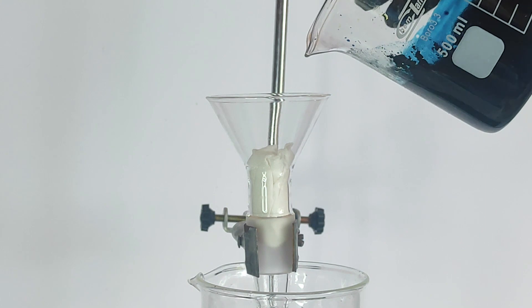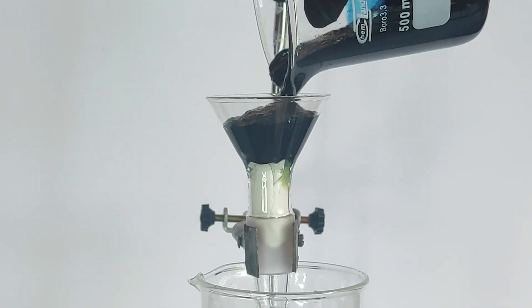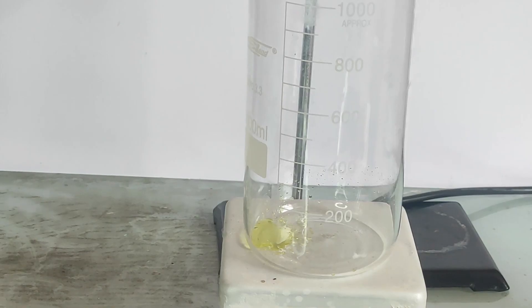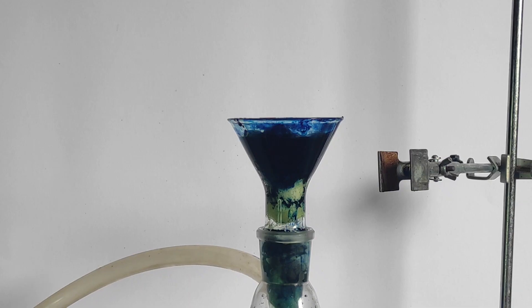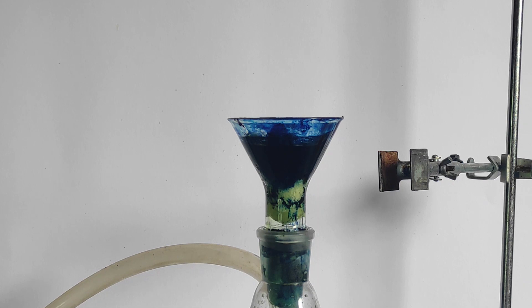Next I've set up a gravity filtration apparatus. This method of filtering was really slow and it wasn't really worth it, so I've just tried to vacuum filter it. Vacuum filtration was way faster and it could also dry our Prussian blue better.